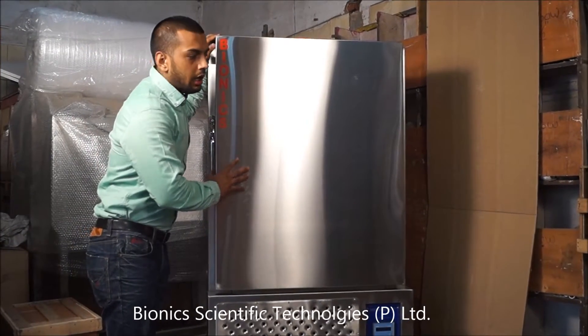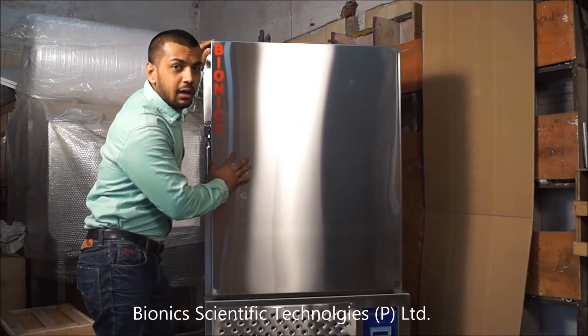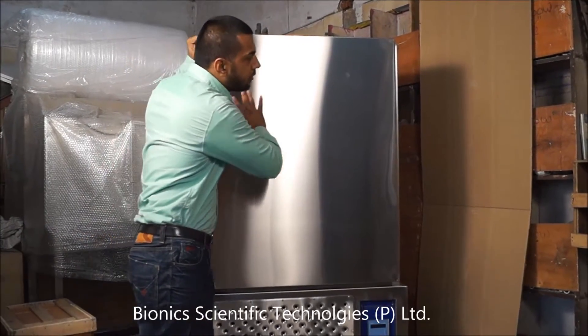This laboratory deep freezer is completely made up of stainless steel.